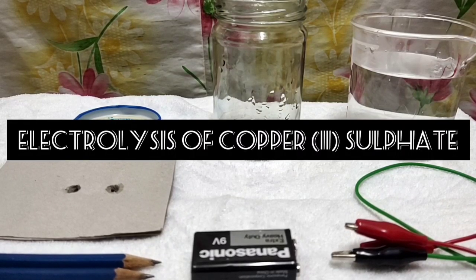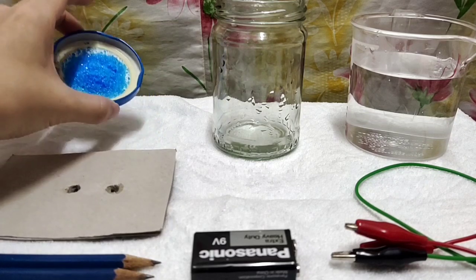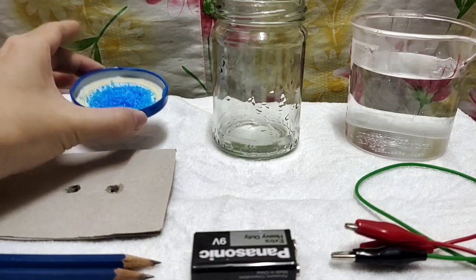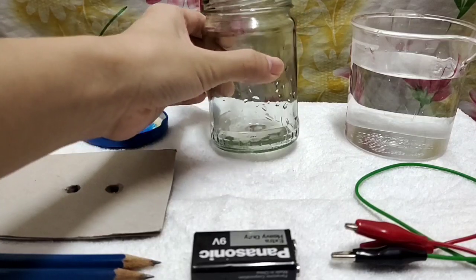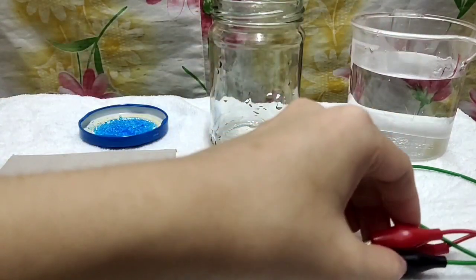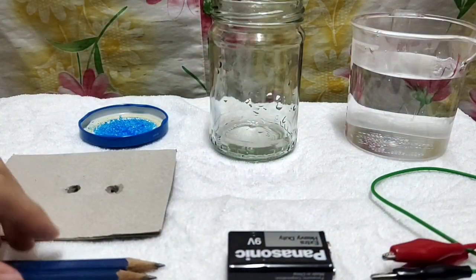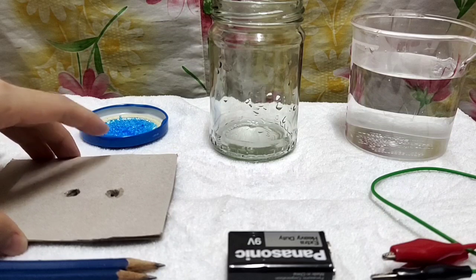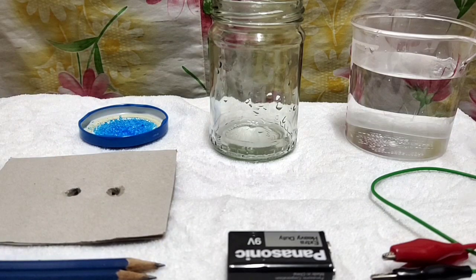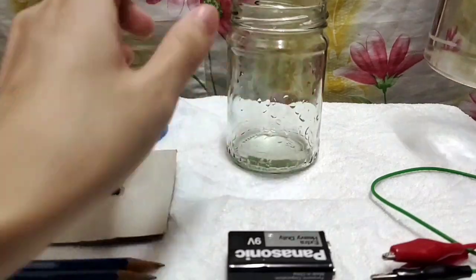Now I will proceed with the second experiment, which is the electrolysis of copper(II) sulfate. Here are my apparatus and materials. I have my copper(II) sulfate, 3 grams of copper(II) sulfate, a beaker, 250 ml of warm water, 2 alligator clips, a 9-volt battery, 2 pencils, and 1 cardboard with 2 holes. I will first pour 250 ml of warm water into the beaker.